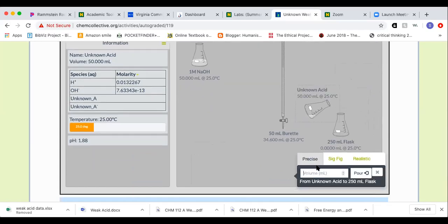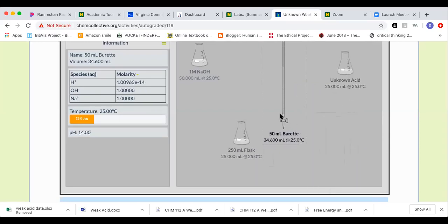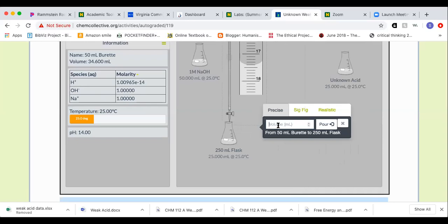What we would do is come back over here and rerun the experiment and say, if my equivalence point was at 4 and I'm saying halfway is at 2 milliliters, what is the pH at 2 milliliters?